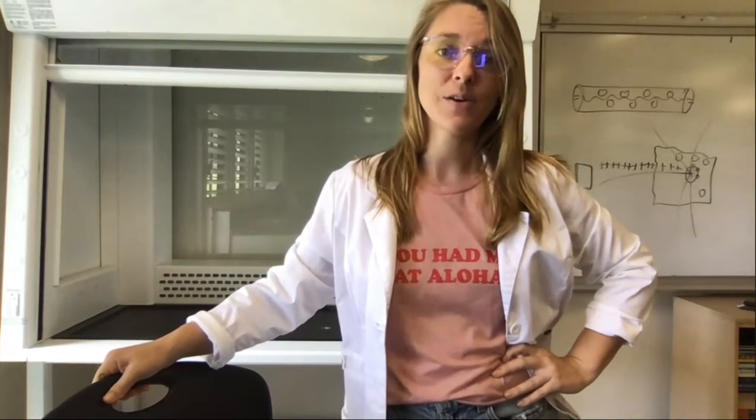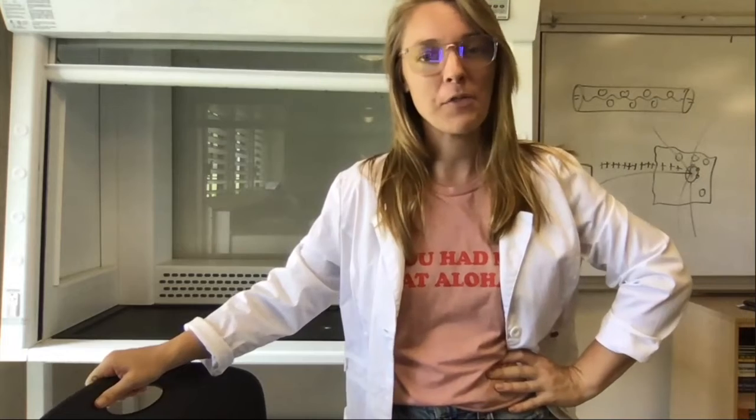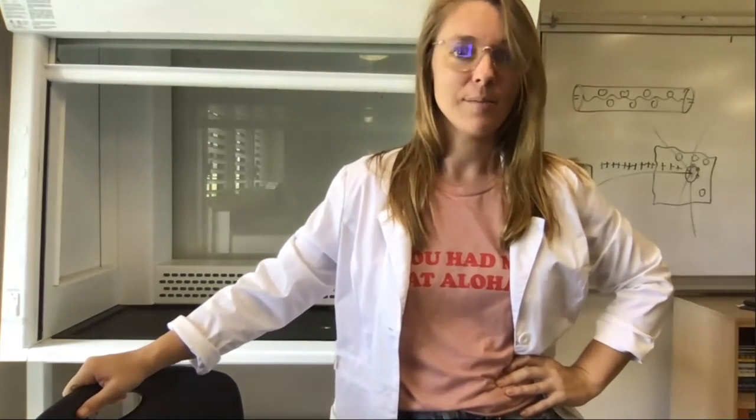Hi, aloha everyone. Today we're going to do a lab on the periodic table of elements. We're going to investigate a handful of different elements and try to figure out their properties and classify them kind of like Mendeleev did many years ago.